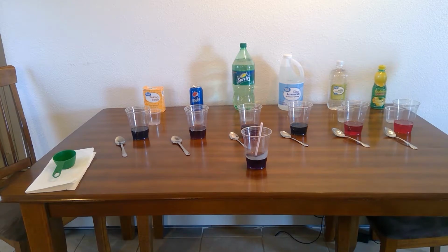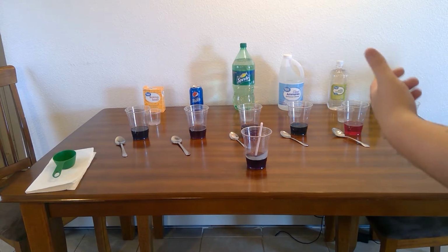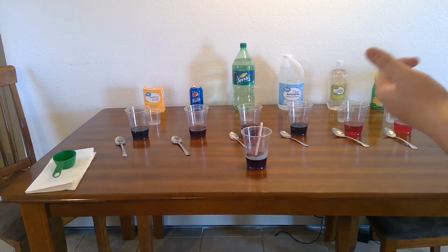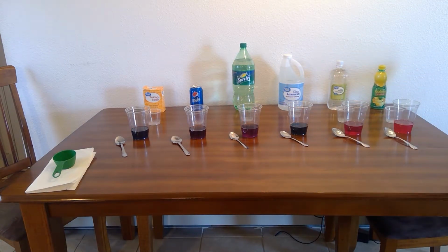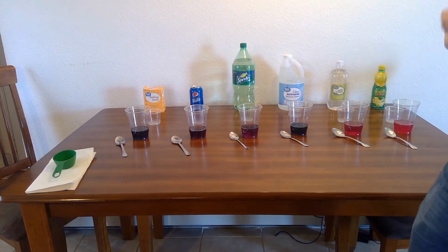The next is going to be the Sprite and the Pepsi. Sprite is a little more than Pepsi, as you can see within those colors. I'll move that actually. Then I would say it's the ammonia all-purpose cleaner. It's just a little greener and brighter than the base baking soda.